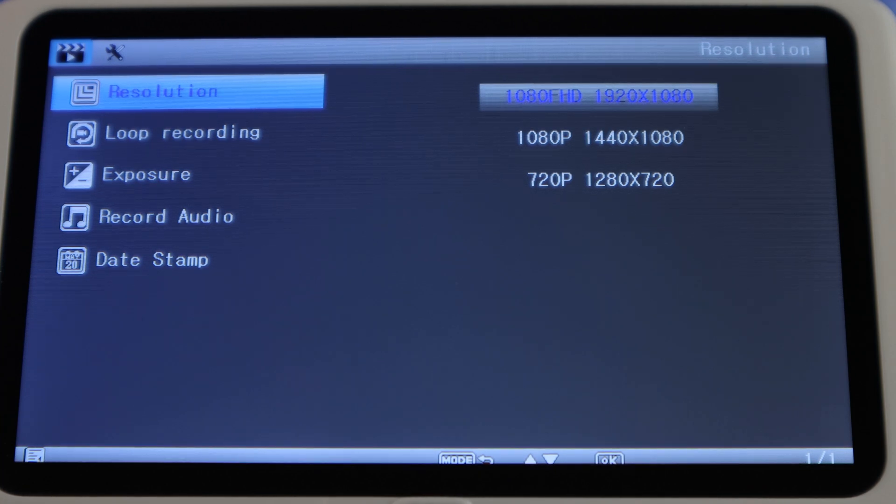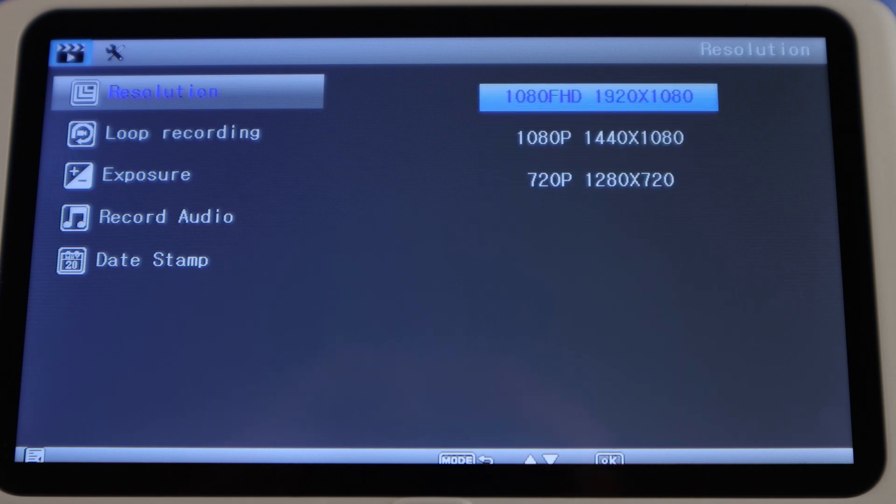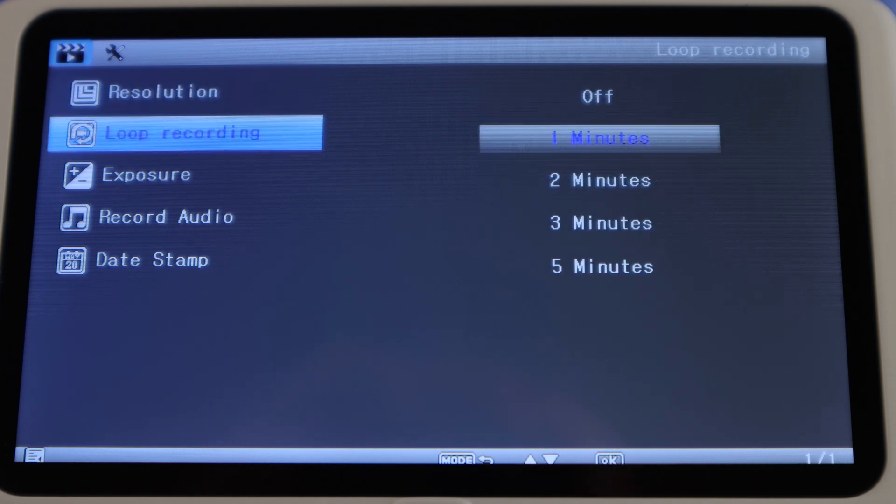In the video settings, you can change the video resolution with 1080p 1920x1080 being the highest resolution. Set loop recording length, which automatically divides your video recordings into clips.